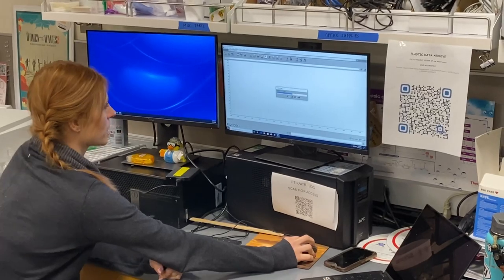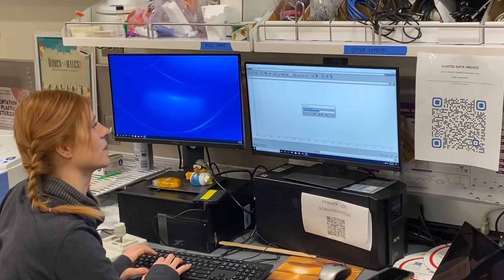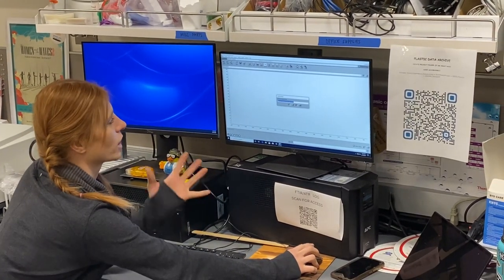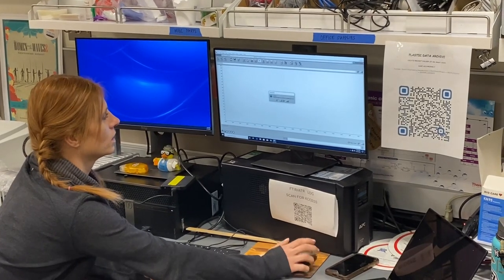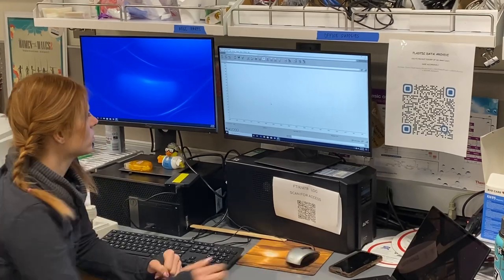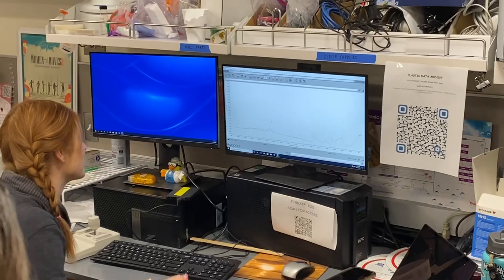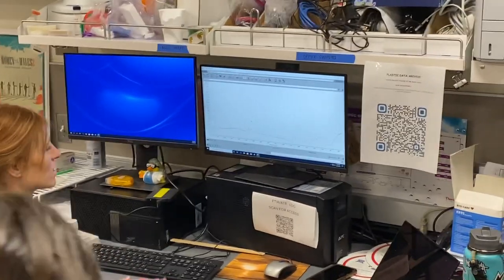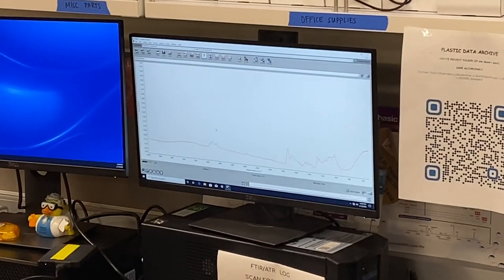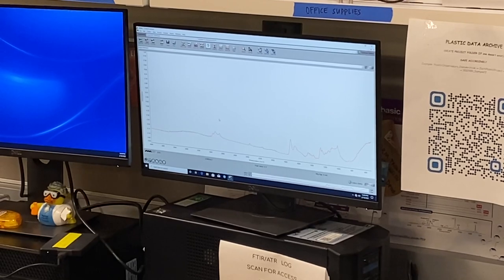Normally we would give it a really cool name, like today's date, blue ruler, sample number one — whatever it might be. And there we go, she's scanning away. Everybody, drum roll — it's very exciting. Takes a minute.